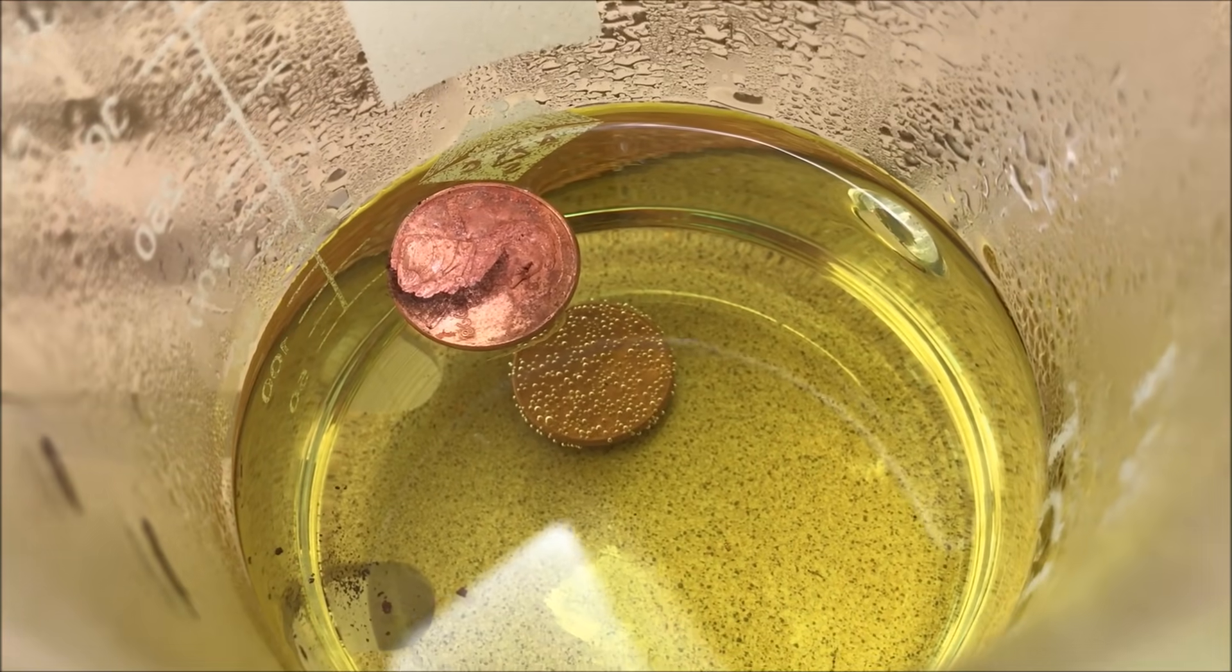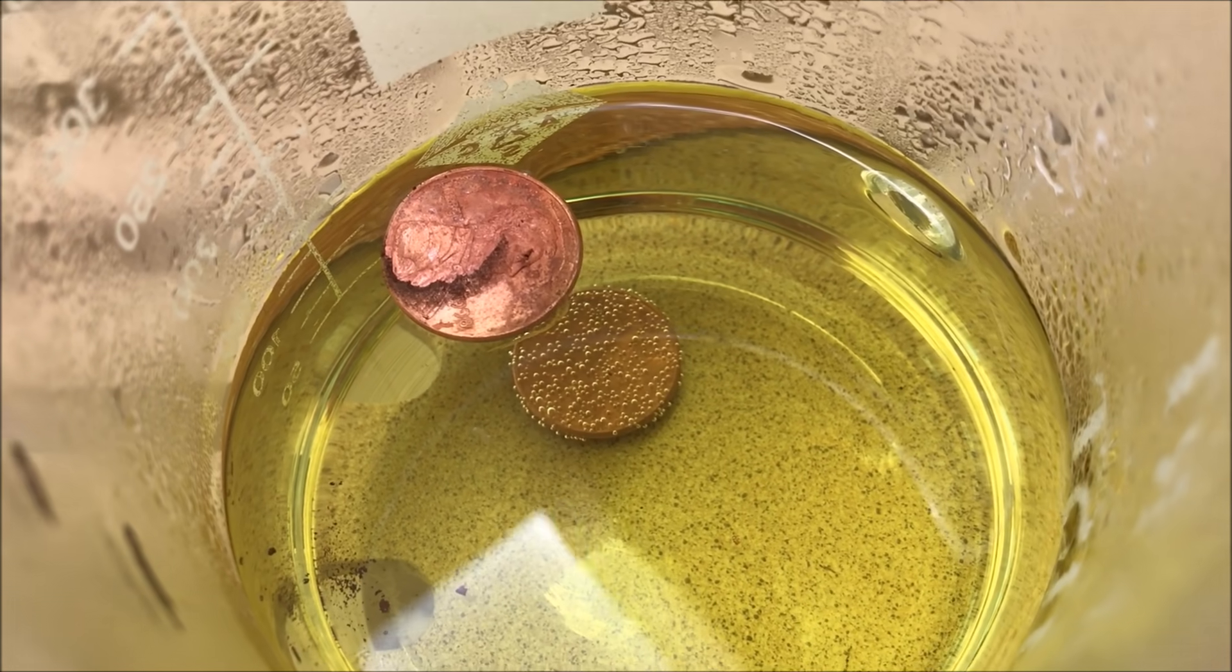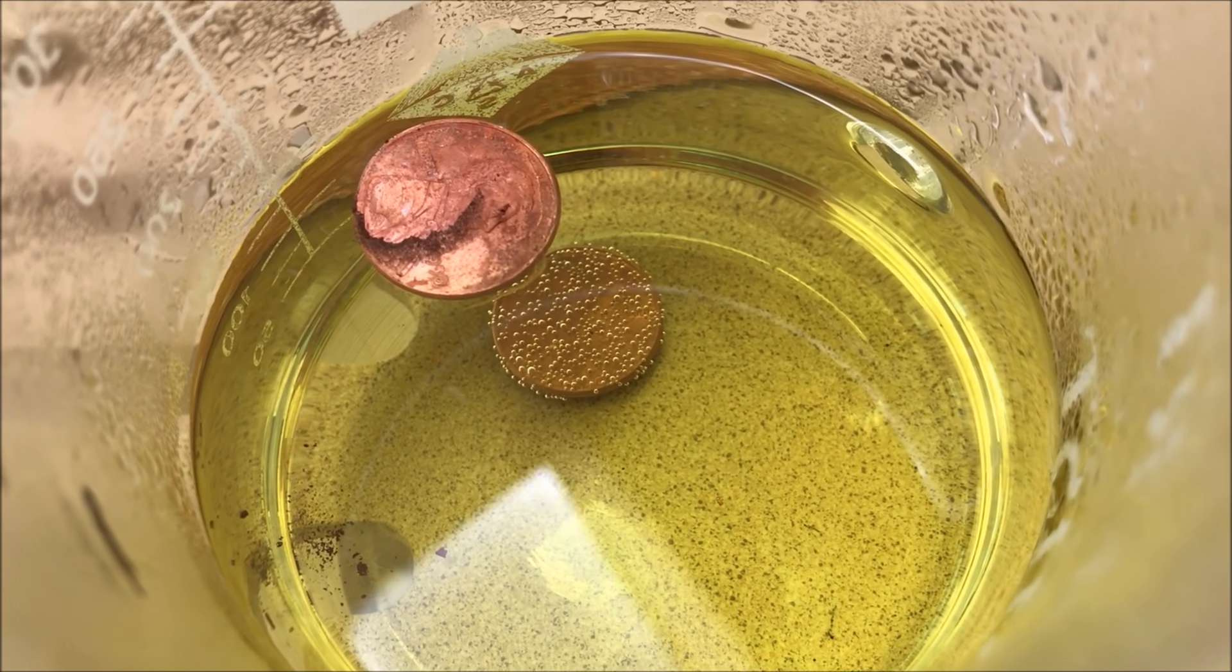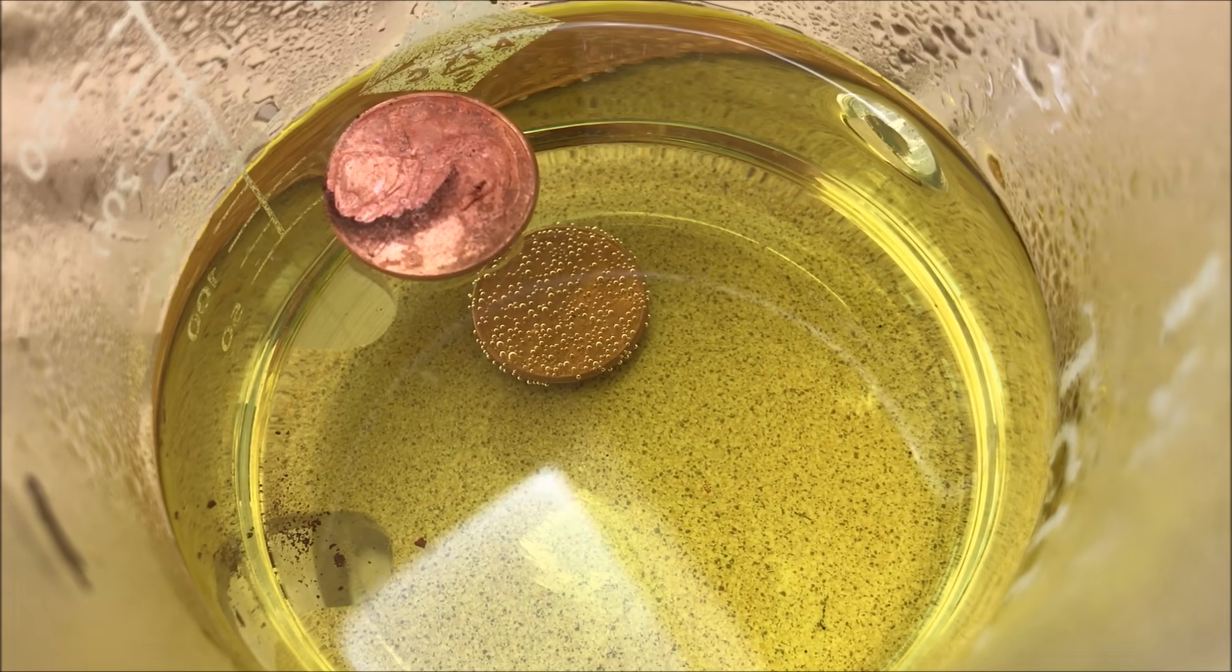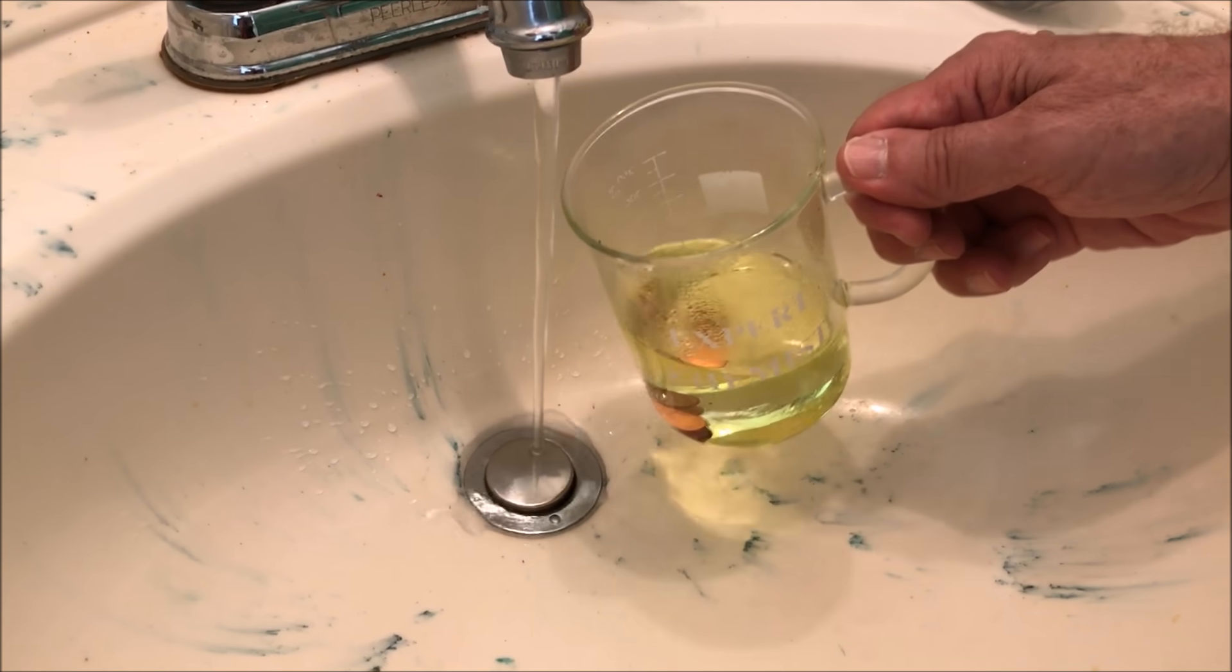We can also see that the substance has turned yellow but that is not related to this reaction. As far as we know, it could be chlorine. We're going to dilute it.